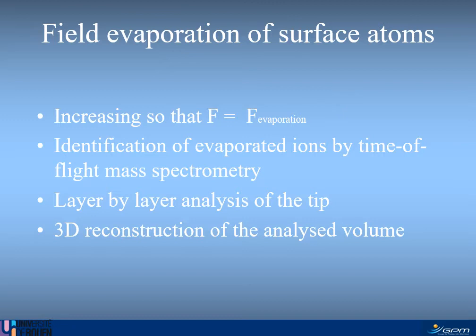With this phenomenon, you will be able to evaporate surface atoms in the form of ions, and then these ions can be identified by time-of-flight mass spectrometry.